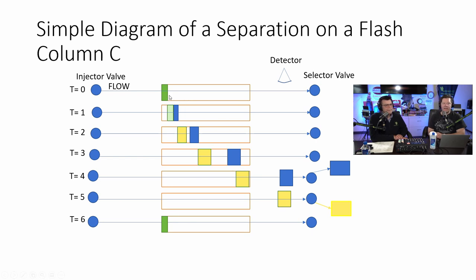So you can actually take a dye and do this in a little column. You can actually see it. It's pretty cool. So you've got the green on the top. And then some time goes by, and it's still flowing, and this main eluent flow is actually pushing this stuff along. So you can see now the blue is starting to separate out. Are you going to put your money on the blue or the yellow? I'm all blue all the way. Okay. I think you're going to win.